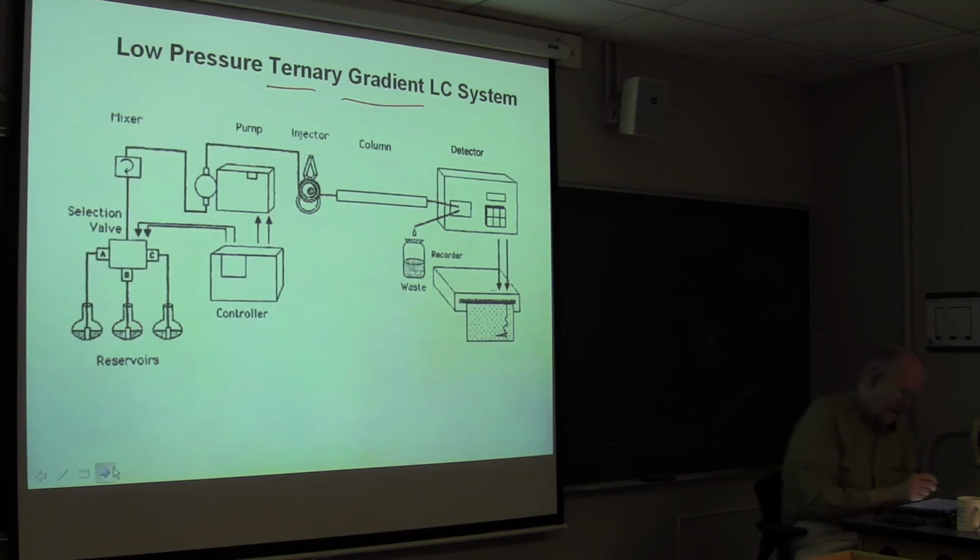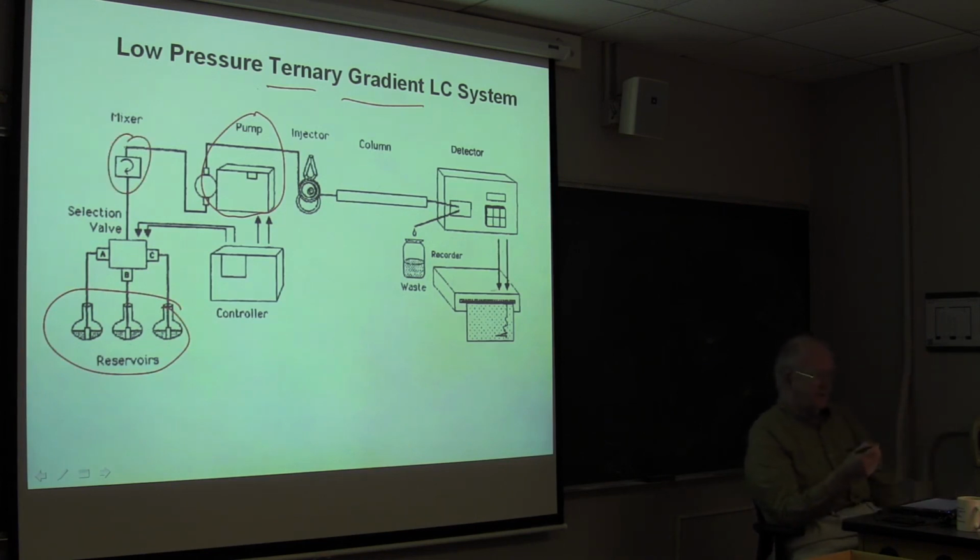Okay. Now, this is a quite different system. We only have one high pressure pump. We're going to feed this high pressure pump with a mixture of our solvents. So that mixture has to go through a mixer before it gets to the high pressure pump.